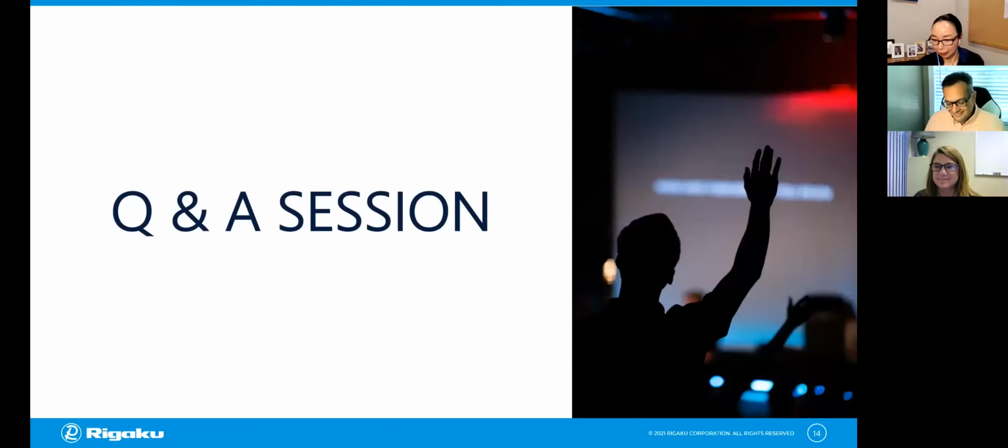Okay, so let's take a couple more questions in the last few minutes. All right, we do have just a couple of minutes here, so I'm going to go through these questions fairly quickly.